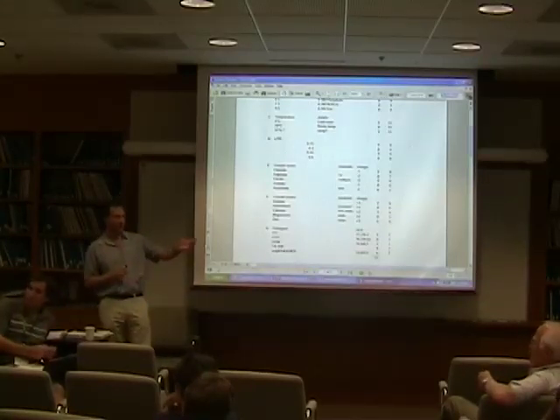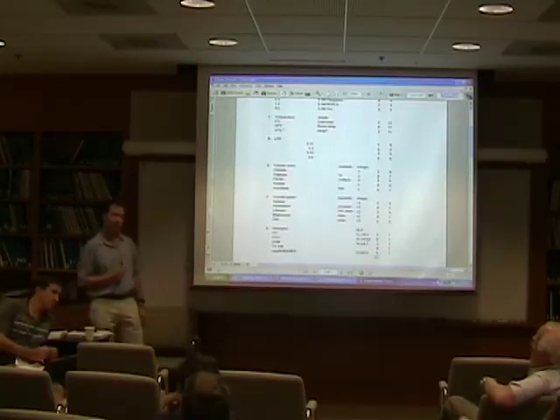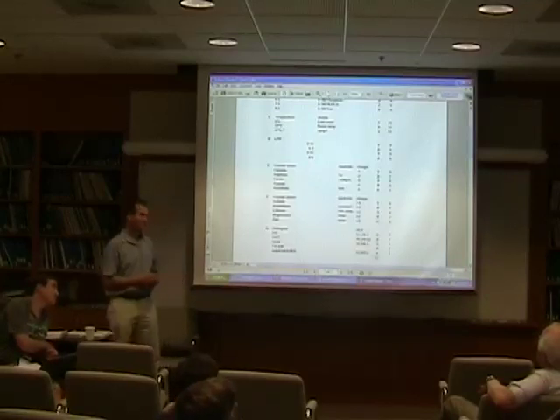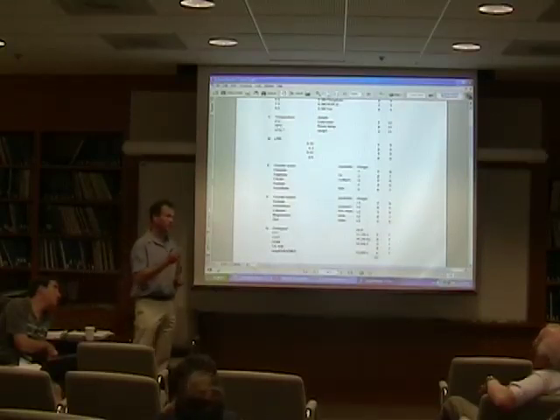Kenny's point before: do we have one crystallization condition or multiple ones? My guess is that there are probably multiple ones, but I'm not sure. For example, with photosystem 2, we've got crystals with calcium, with magnesium, with sulfate, with fluoride, with zinc. But then the question is, if with calcium the pH should be one thing, and with magnesium the pH should be something else, that means they're coupled. And then this matrix thing wouldn't work, if you treat them as independent.